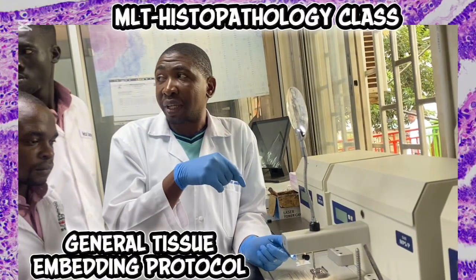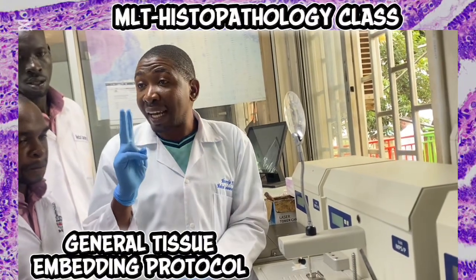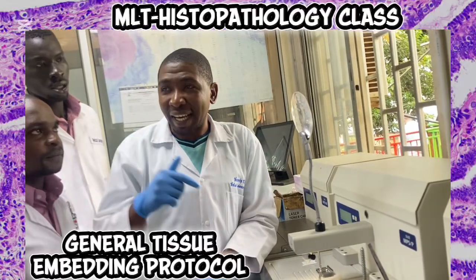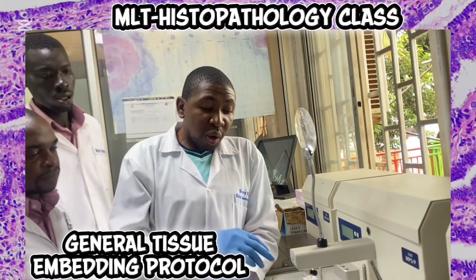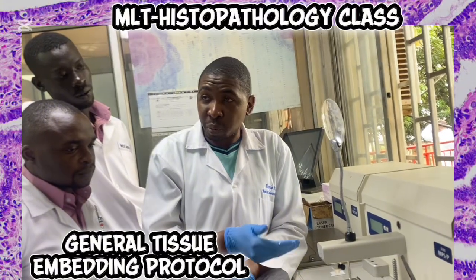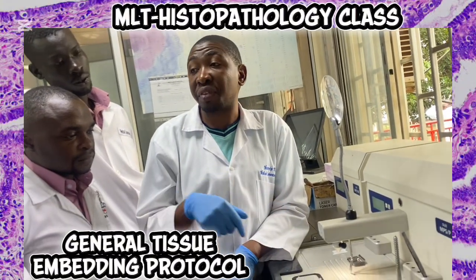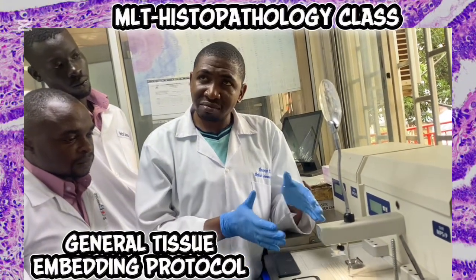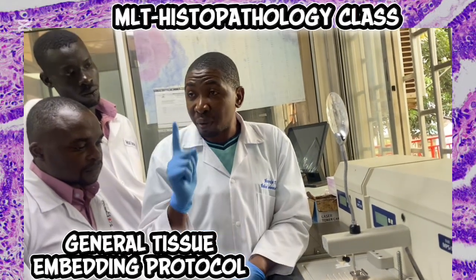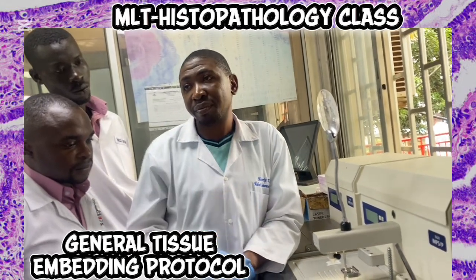What is going to happen? You are going to form two layers, like in blood agar, double layered. So the more you delay, the first wax that was put in the mold will solidify. So the time should be literally very short, so that we form a uniform tissue block.